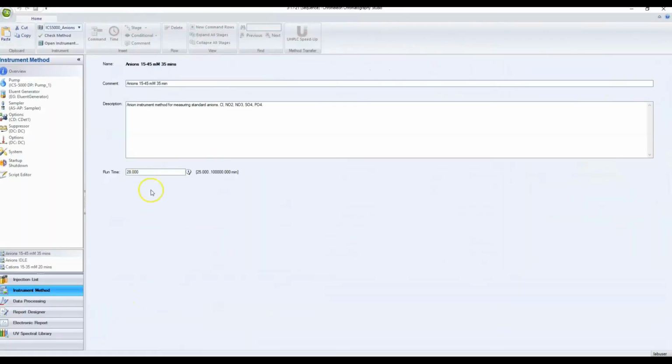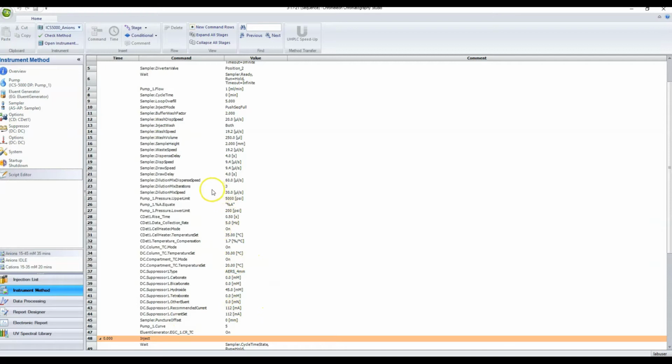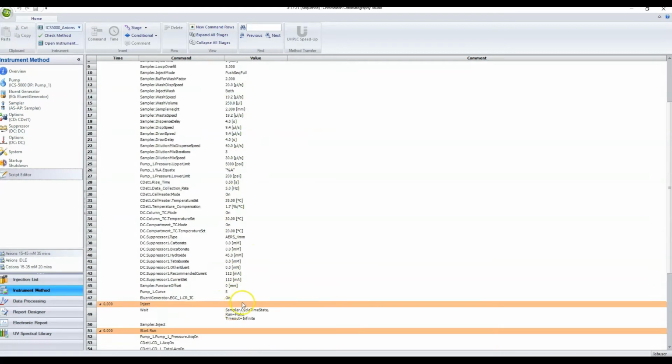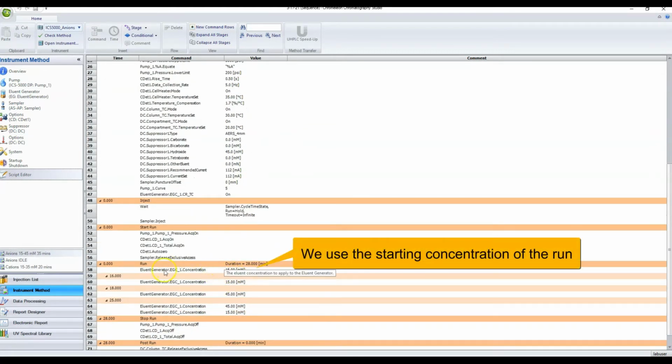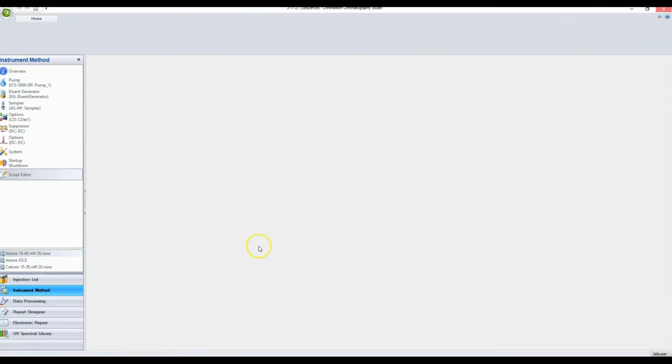And I know this is a lot, but I will cover it all in detail later. And I'll go to this script editor and just kind of scroll through here until we see all those settings that we wanted, right? So the suppressor recommended current is 112 milliamps. Remember how we set it to 112. Now we got to look for the pump flow rate. Pump flow rate is 1 milliliter per minute, so that's what we set it to. And let's see where it says eluent concentration. It's 15 millimolar. Oh, right here, eluent generator concentration, 15 millimolar. Okay, so let's get out of this and go back to our run.